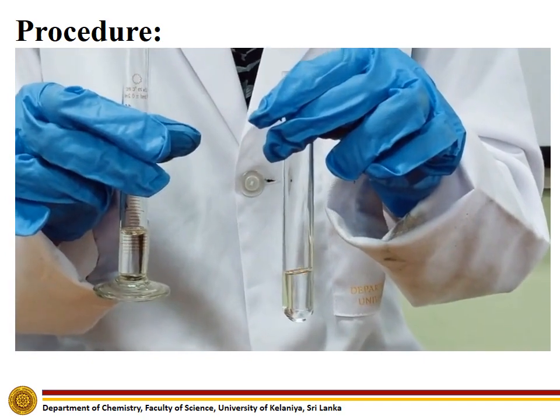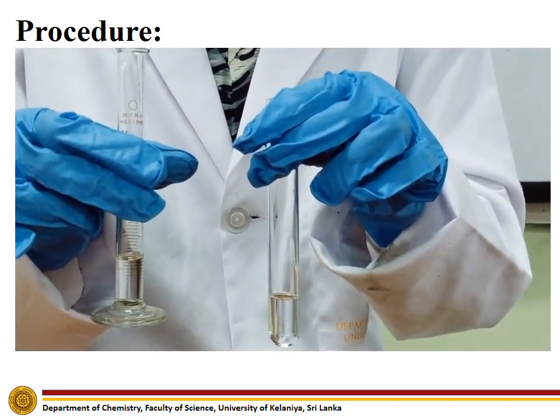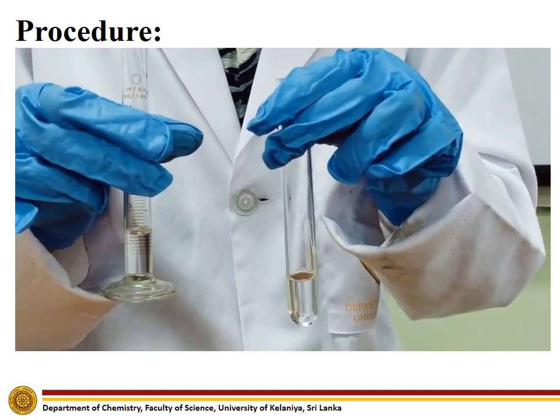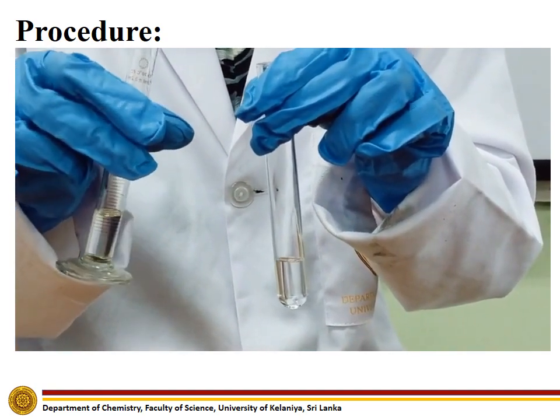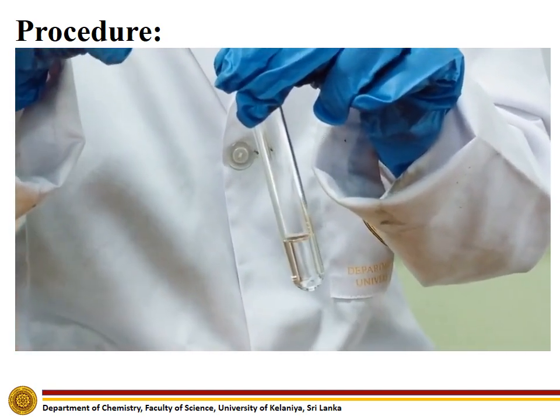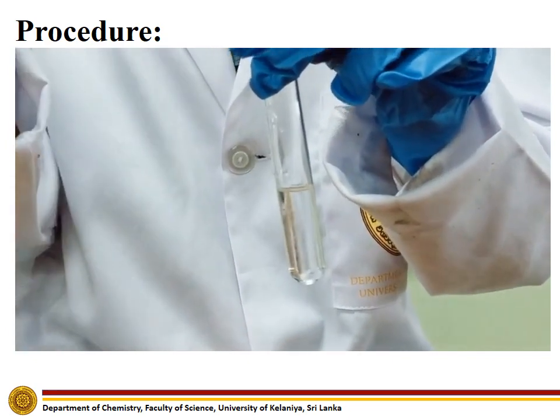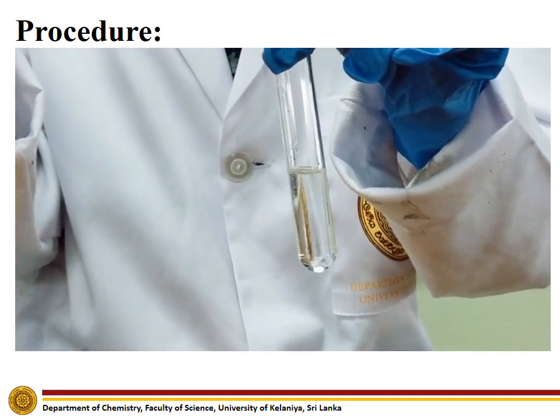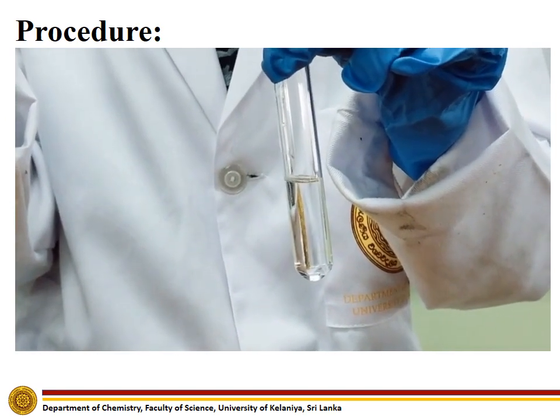To carry out the second experiment, add about 2 ml of sodium hydroxide solution to the test tube containing the carboxylic acid and check whether a clear solution is observed. Here, a clear solution can be observed.